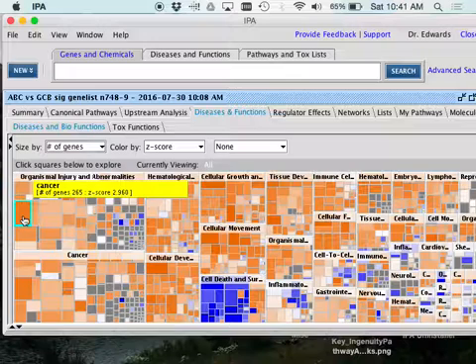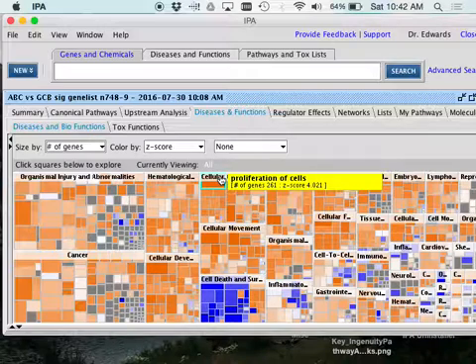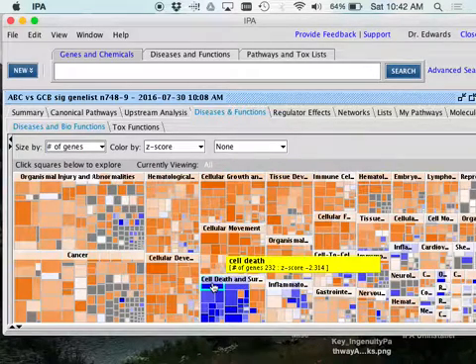Not only that, but this software is very smart. Like I said, it's probably the deepest, well-curated database in the world. So out of those 265 genes that are associated with cancer, based on the expression or the direction of those genes, it'll make a call on whether that function is more active or inhibited. The more confidence it has that it's activated, the more orange. The more confidence it has that it's inhibited, the more blue. We can click on any of these and get those genes and see the papers where it says that.